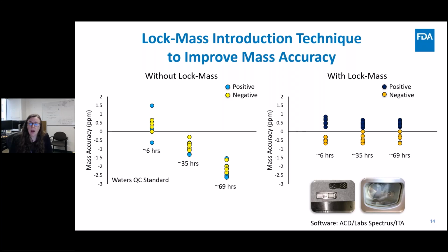while we're running. And for that, we use this little steel holder, and there's space in this holder for 2 sponges, and these sponges are about the size of a pencil eraser. You can dope your calibrant ions directly onto the sponge. And then there's a little lid with a variable number of holes in the lid, to account for the different volatility of those different lock mass ions.